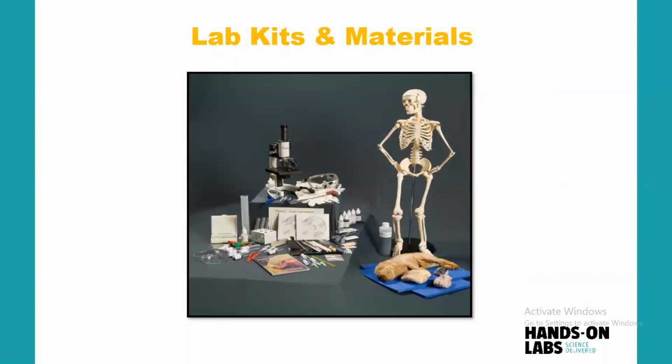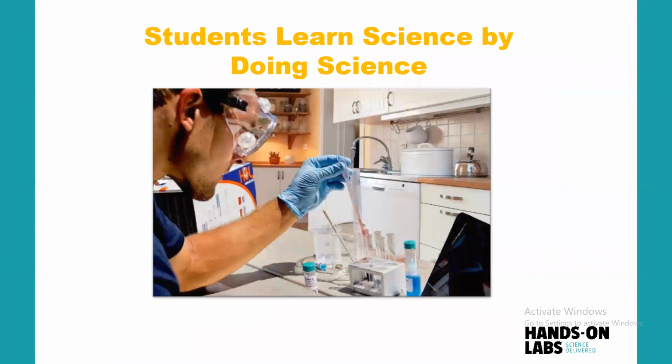Ben already showed you a photo of some typical chemistry materials. Here gives you an example of the A&P. So we provide a variety of dissection specimens, a 3-foot tall to scale human skeleton model, and a variety of reagents to show physiological processes that occur in the human body. We also offer microscopes for students to use to view various slides.